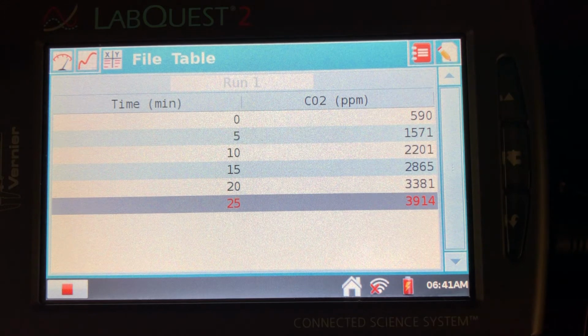So we'll talk a little bit more about how we transform that data because there is a series of data tables that you will be filling out. Those data tables include not only the masses of your worms and your bean sprouts, because we need the mass in grams to calculate, excuse me, we want to be able to calculate the amount of CO2 that's being produced per gram of the organism.